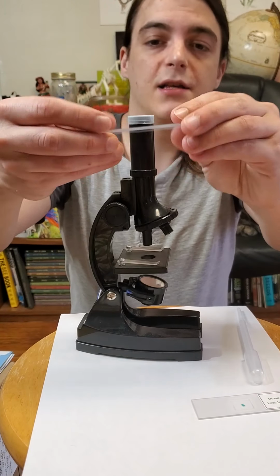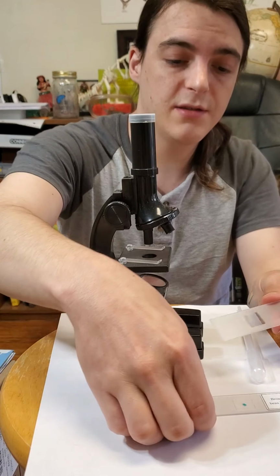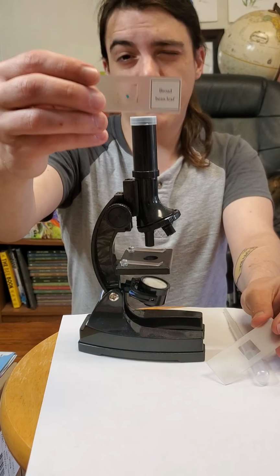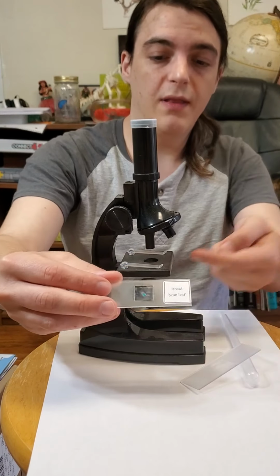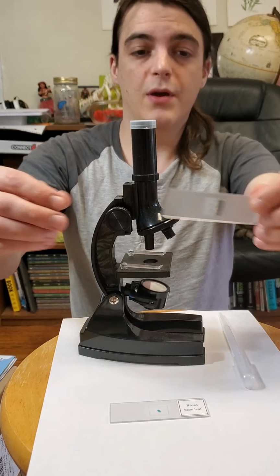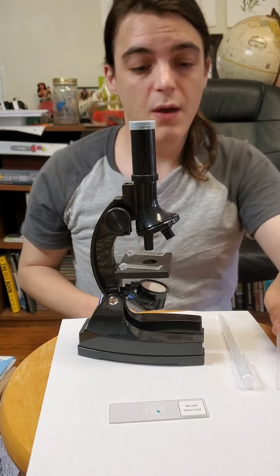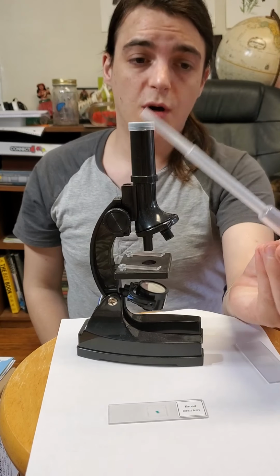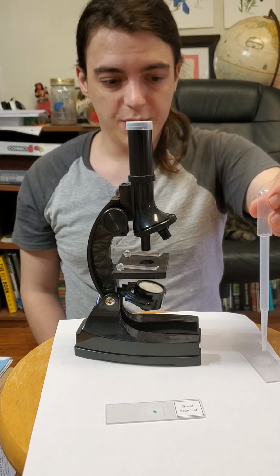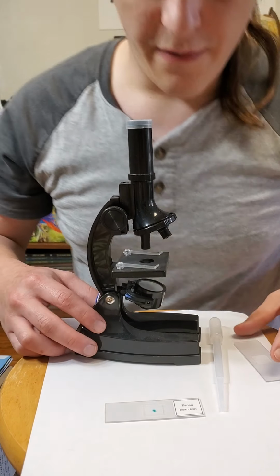Now, a slide, when you get it, is first going to start like this. You have to cut a little piece of whatever you want to look at. Usually you want it cut so thin that it'll be clear, so that when light shines up through it, you can see it a lot better. You're either going to cut a small piece to put on your slide, or you can use what's called a pipette, suck up your liquid samples and drip them right onto your slide. So these are all very important parts of it.